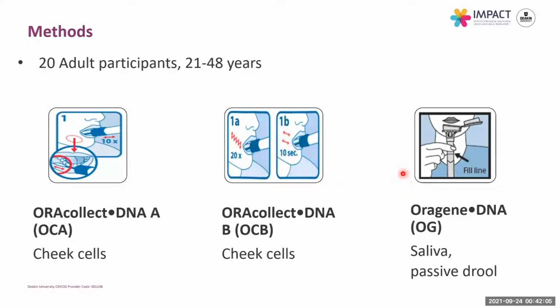This is compared with saliva, in which no cheek rubbing is performed, and which was collected unstimulated via passive drool for 3 to 5 minutes to allow sufficient time to collect 2 ml of the saliva sample.